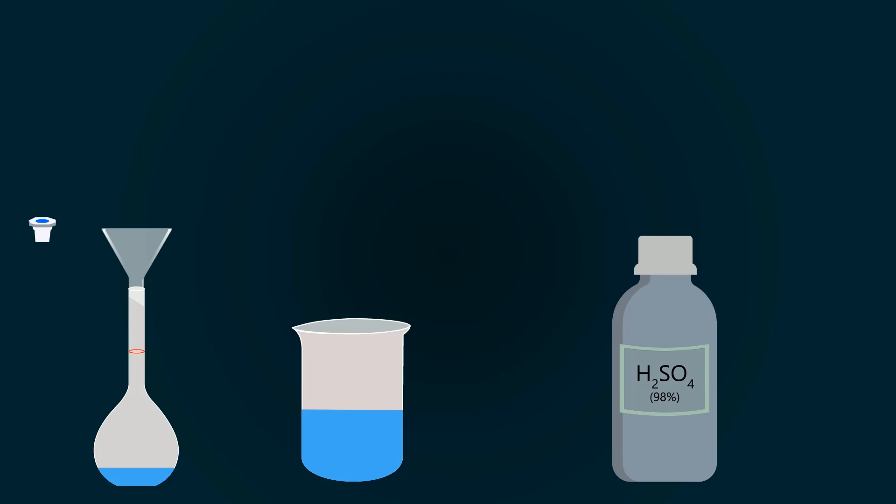Now take the bottle of 98% H2SO4. Open the lid and pipette out the required volume, which is 127.5ml. Now pour this into the volumetric flask.